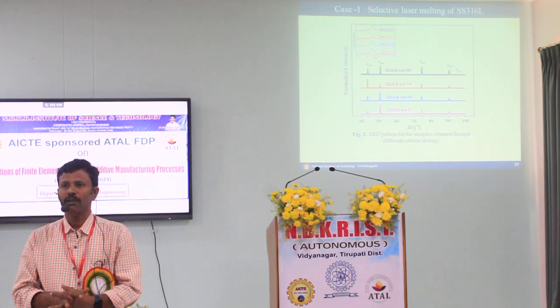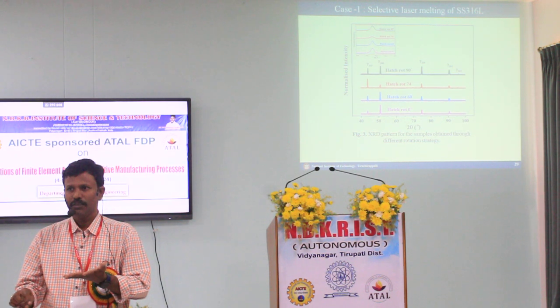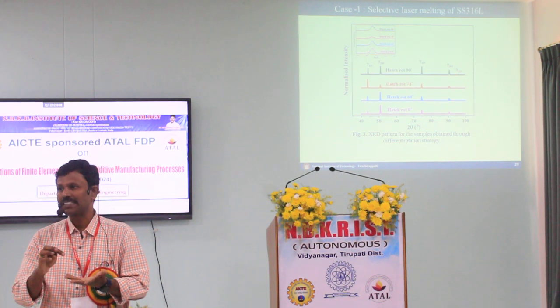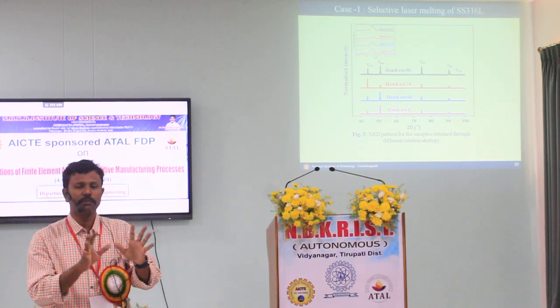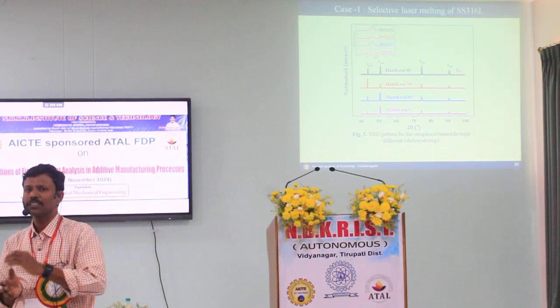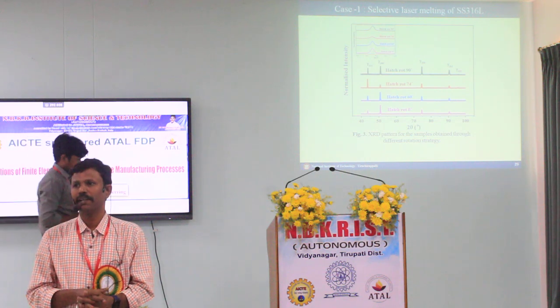If I do chemical composition, it will say aluminum this much, silicon this much, carbon this much. But whether aluminum and silicon carbide are available together, or aluminum carbide is there, or silicon carbide is there, or aluminum silicide is there, we don't know. Chemical analysis will give chemical species quantification and analysis. XRD, any diffraction, will give us phases based on crystallographic origin. That means the way the atoms are arranged in a periodic pattern.